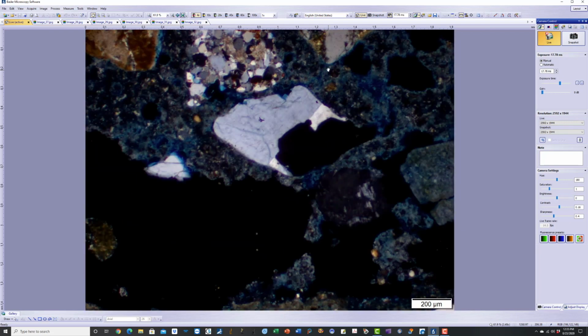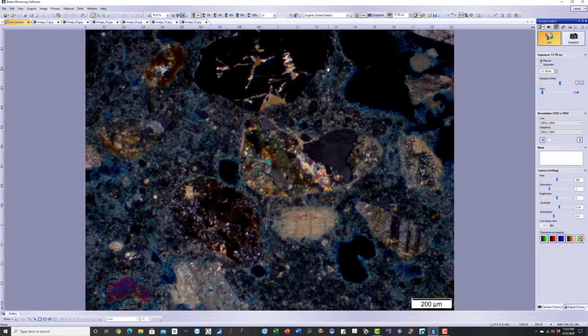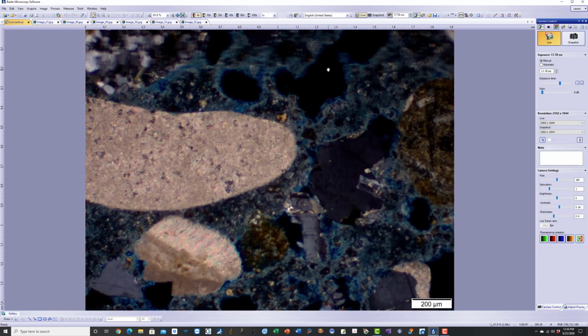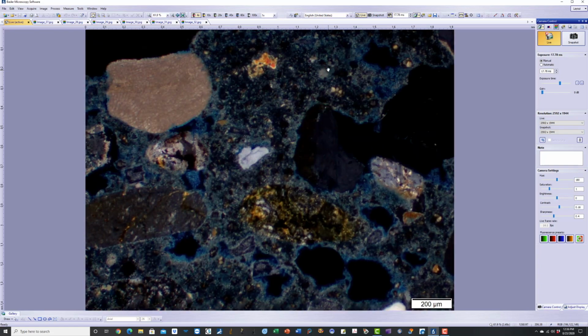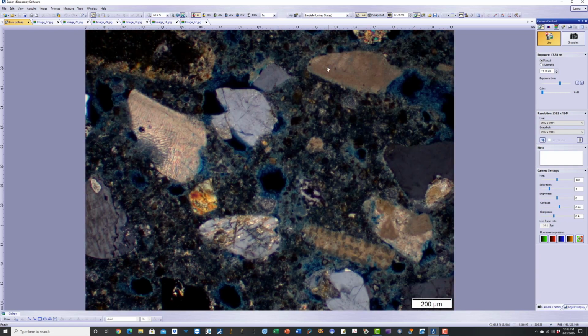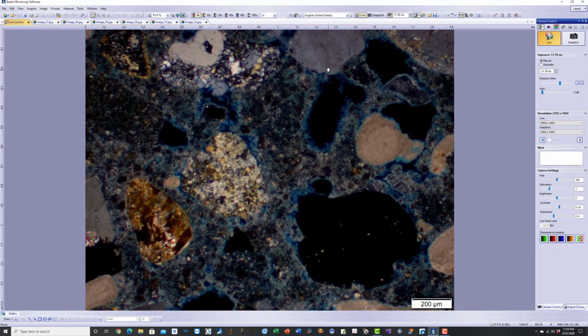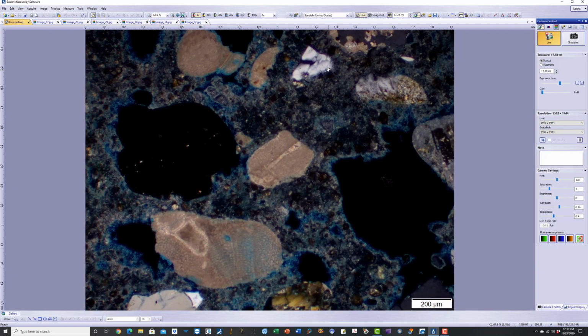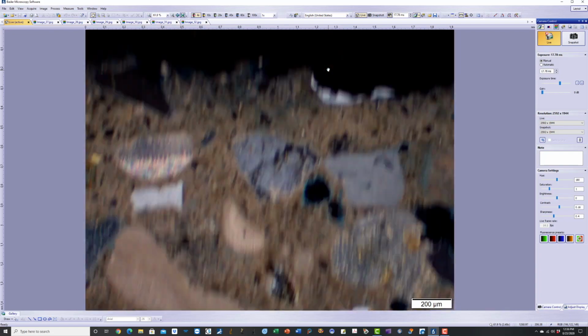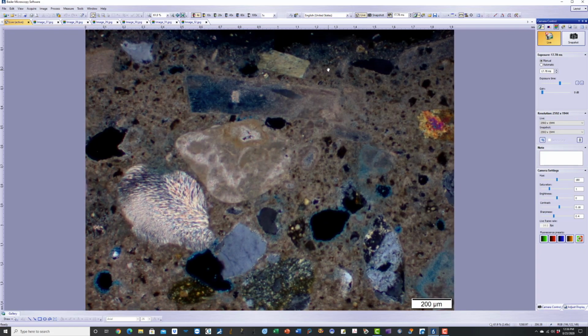The protective coating could have been better densified, then it would have been less carbonated. The fact that the protective coating is carbonated is a testament to its inherent porous nature. Through the entire depth of the mortar coating, you can see the paste has been carbonated. You have patchy carbonation in the interior to severe carbonation at the exposed surface region.